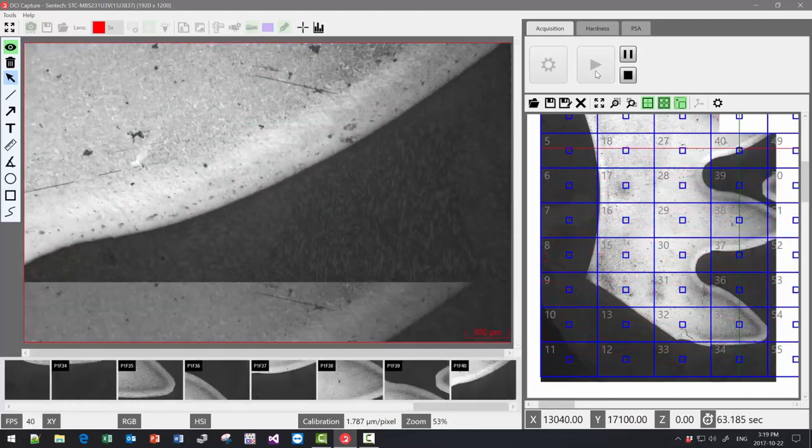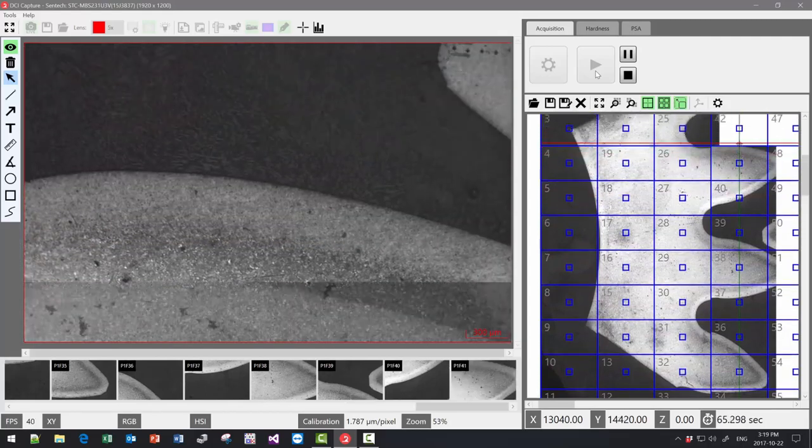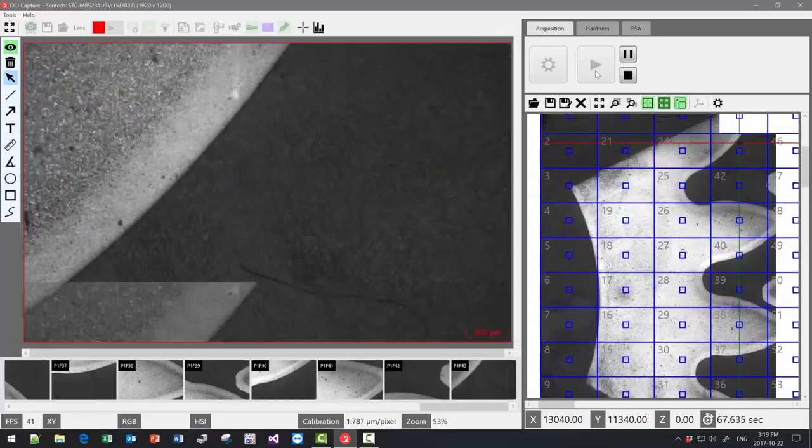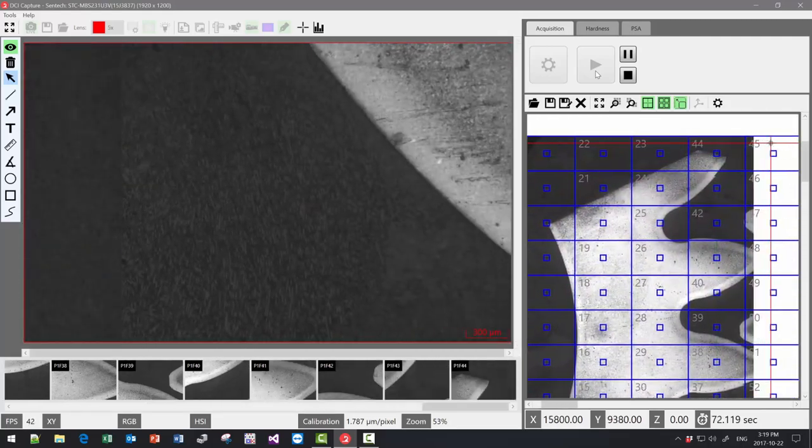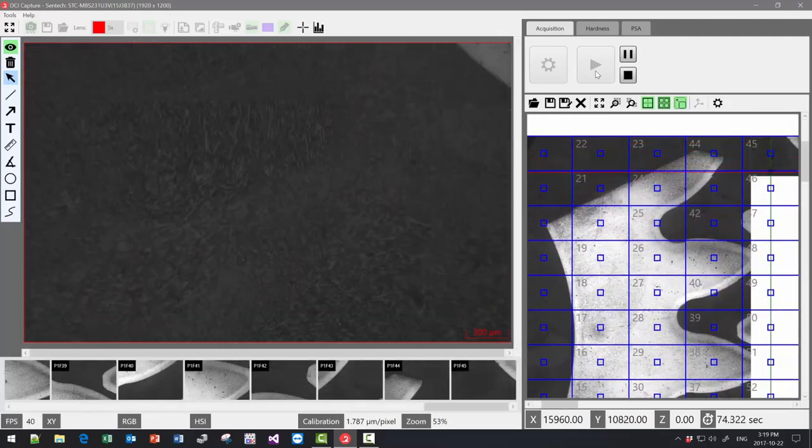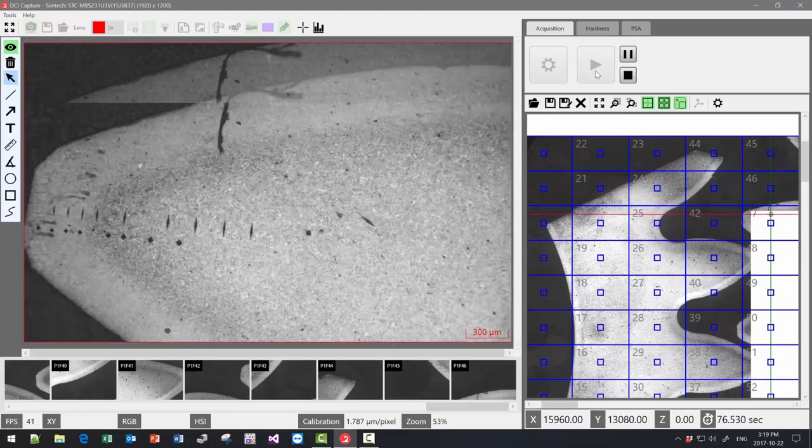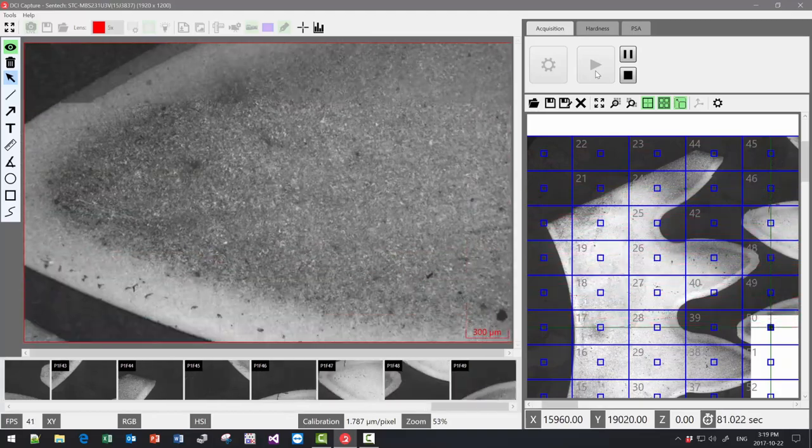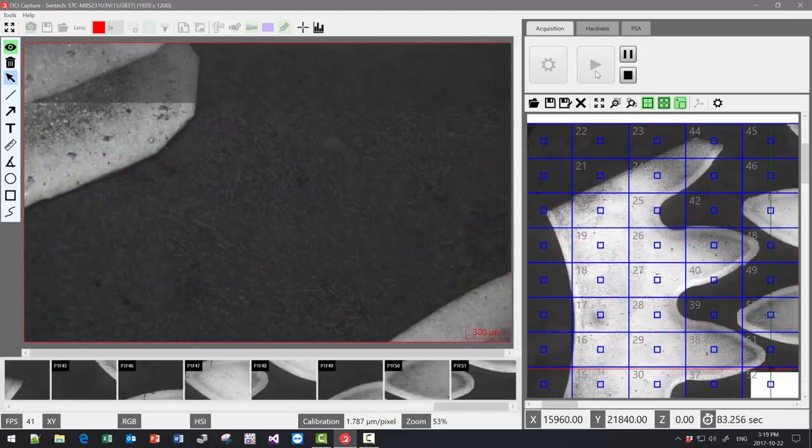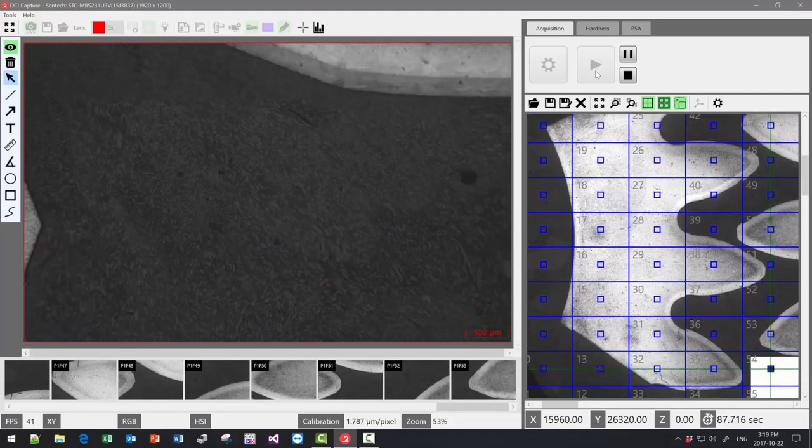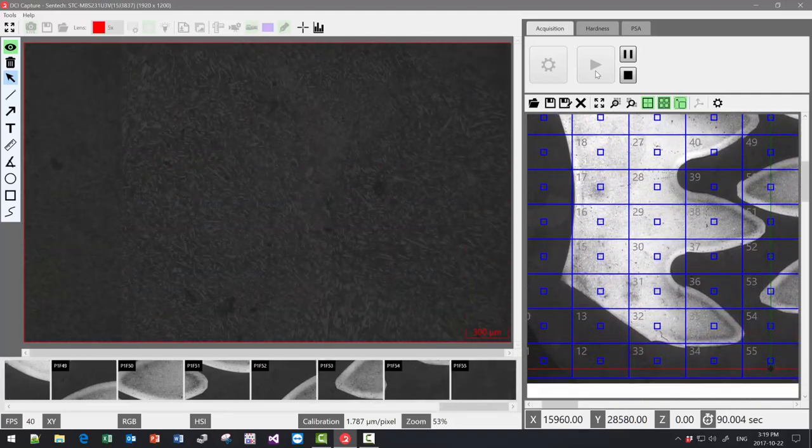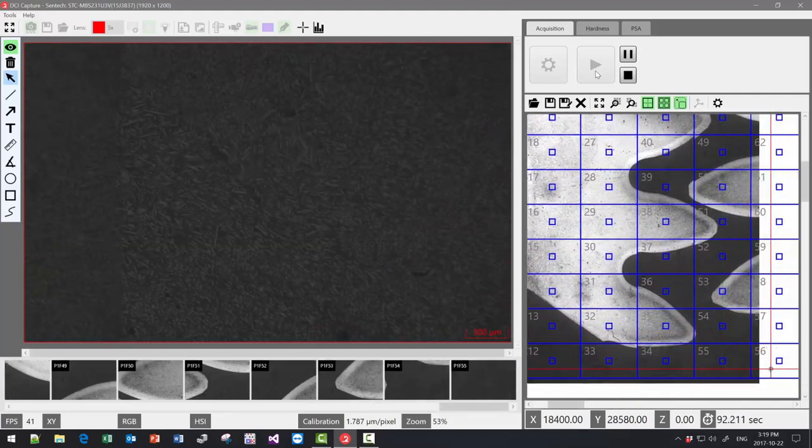With a travel of up to 100 millimeter and a 10 micron accuracy, this encoded stage is a great asset in acquiring high-resolution images for documentation or image analysis purposes.